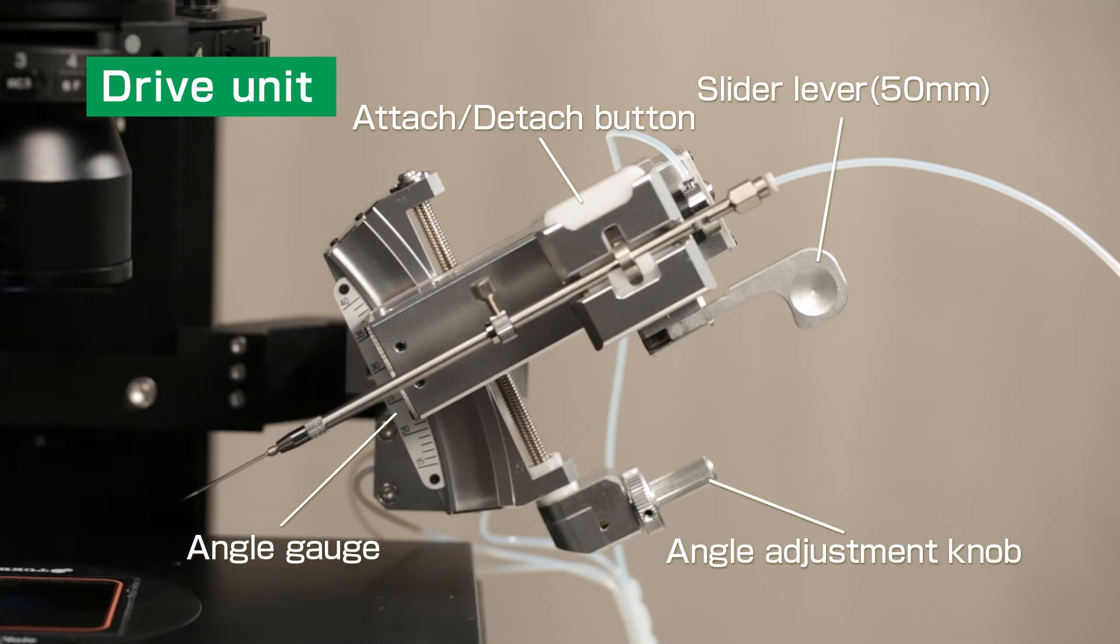Exchange of petri dish and pipette can be done safely as the slider level lifts the pipette tip 50 millimeters. The drive unit is also provided with knobs and a gauge for angle adjustments.